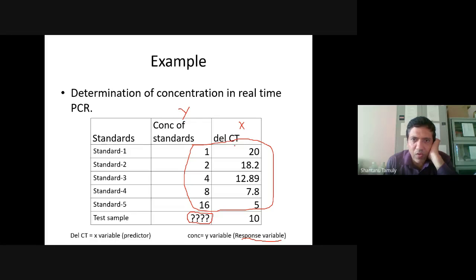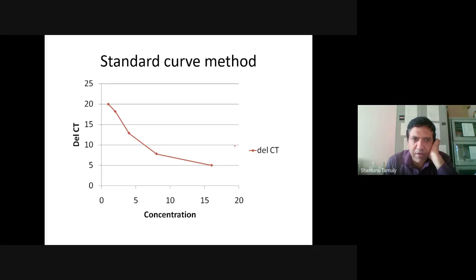Okay, x and y. So this is the graph we have made, the standard curve. Standard curve means the curve which we have made from our standard solutions. And now we have to find out what is the concentration of the test solution.